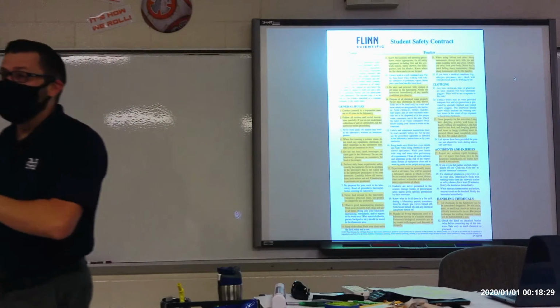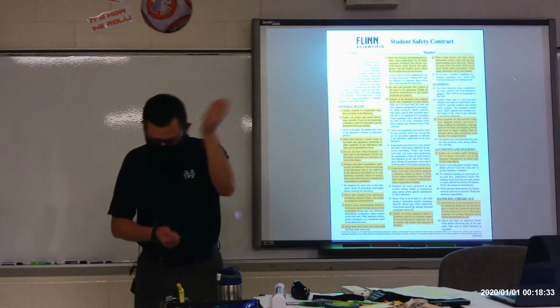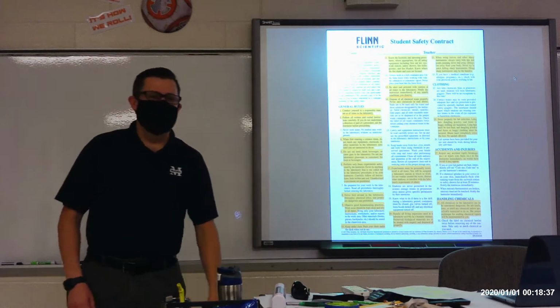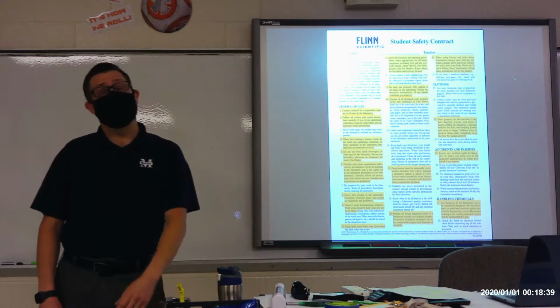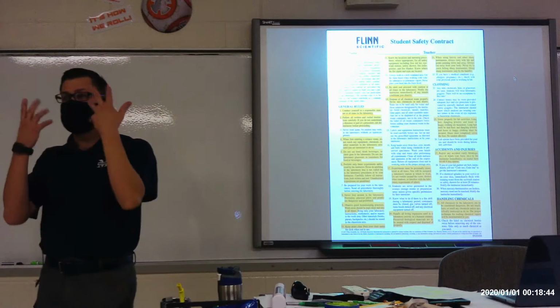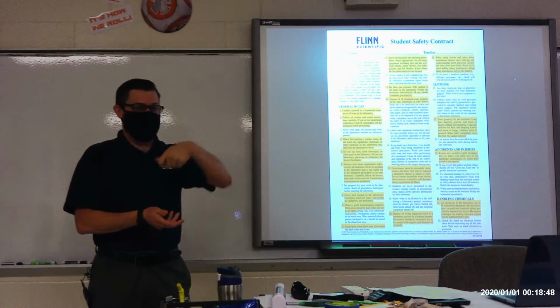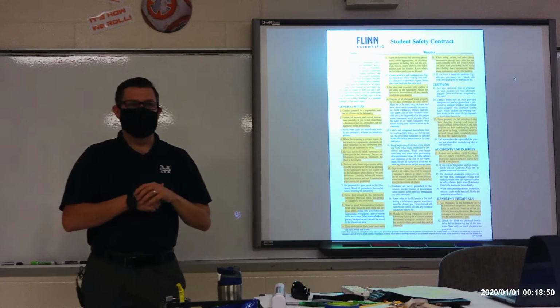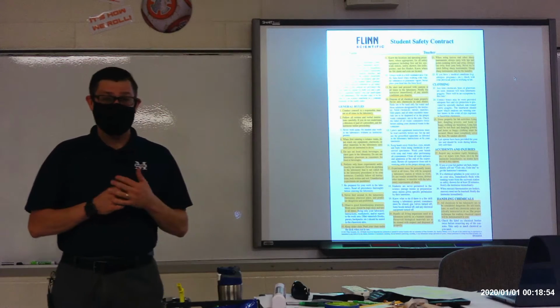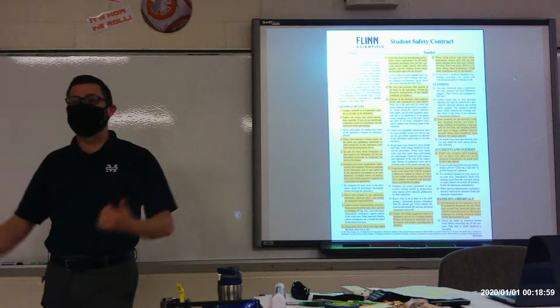In the zombie college video, there was a funny moment where one girl sprayed the guy with the fire extinguisher. That wouldn't be funny in real life, because those things can actually cause chemical burns. And if the chemicals coming out of the fire extinguisher get into your eyes, it could blind you. So we don't need to be dousing somebody with the fire extinguisher if we don't have to. In fact, if somebody is on fire, what do you do? Stop, drop, and roll. You were taught that in kindergarten.